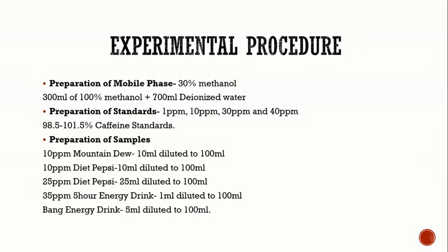Also for the 25 ppm Diet Pepsi, we dissolved 25 milliliters into a 100 milliliters volumetric flask to make the 25 ppm of Diet Pepsi.